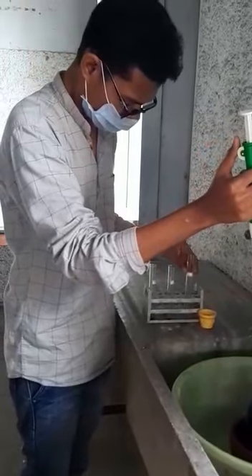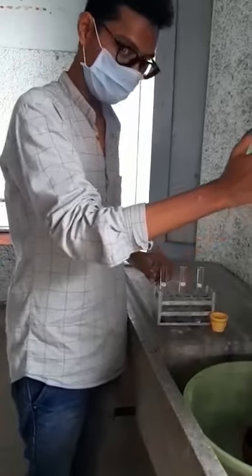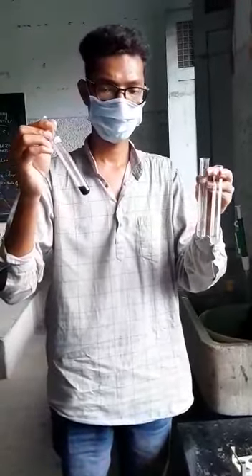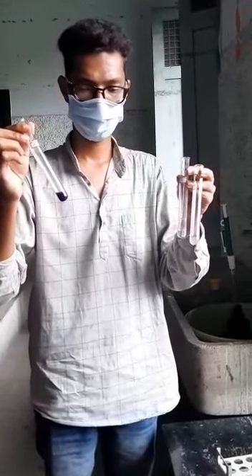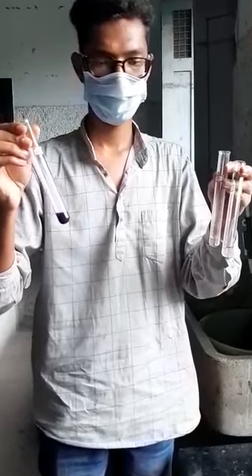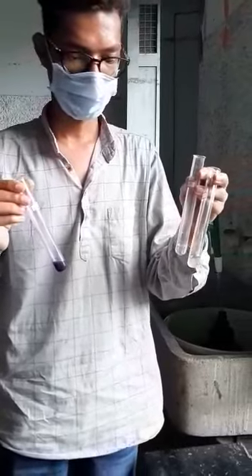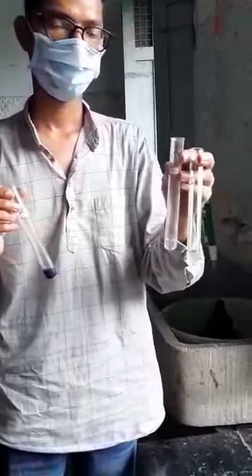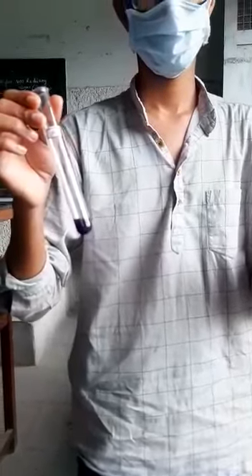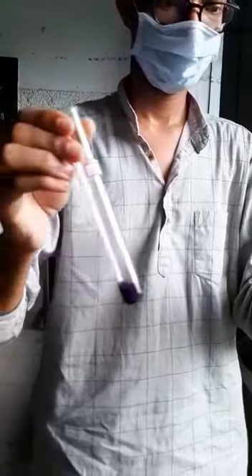You show only A and C. See, after adding Molisch reagent and concentrated sulfuric acid, he could identify in sample A a purple violet color. Okay, that indicates the presence of carbohydrates. But whereas in the other samples there is no change in the color. That indicates there is no carbohydrate. This is the color you should get for the Molisch reagent. Okay.